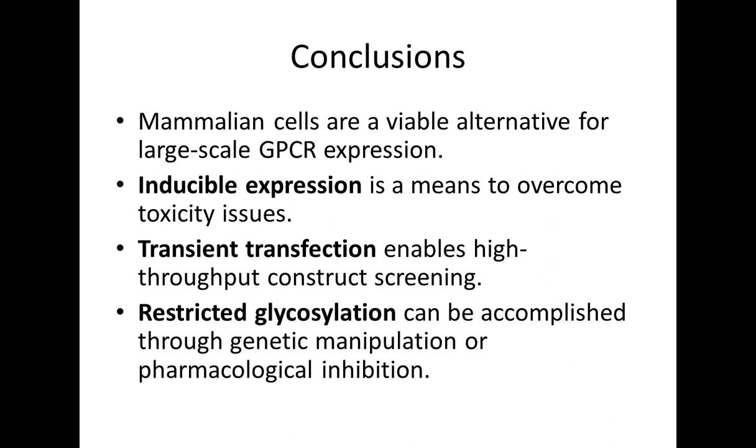We have used a 6X His tag, but in our experience, those nickel, His tag purifications tend to be a lot less pure at the end of purification. So we tend to use FLAG tags just because the purity is that much better. We haven't explored a whole lot of tags, but in a head-to-head comparison between FLAG and His, FLAG is far superior.